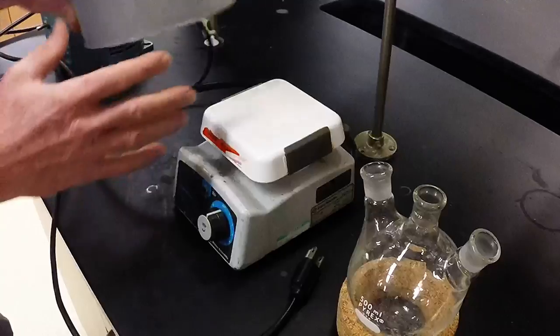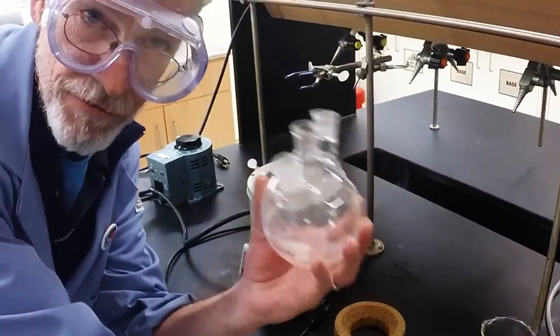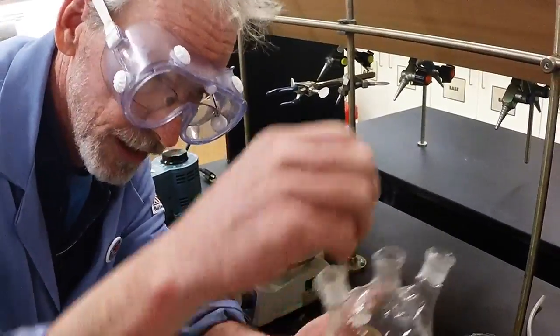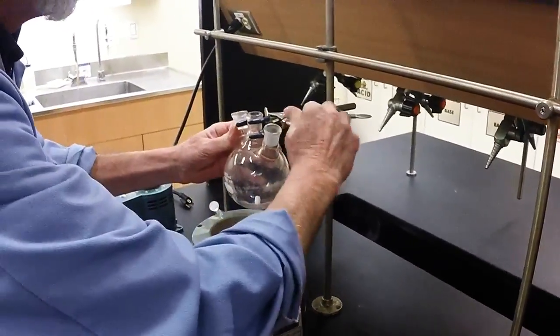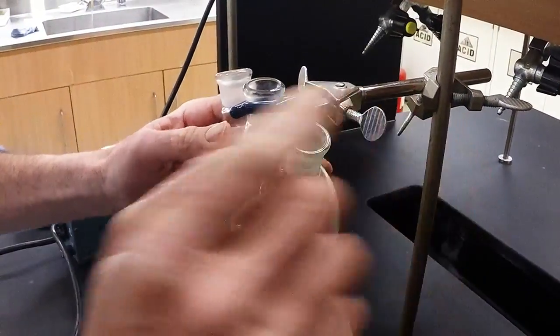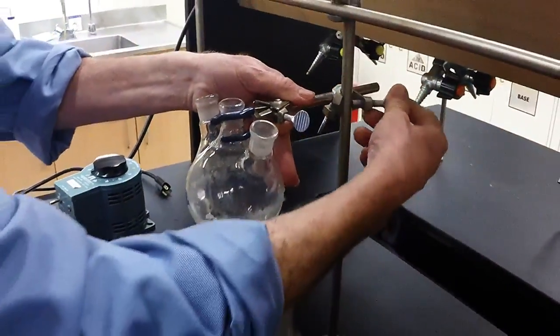Stir plate. Big heating mantle this time, and I have a 500 milliliter three-neck flask. We're going to need a stir bar. Don't drop it — it'll break the bottom. Slide it in the side. Very important: we must clamp nice and square. Make sure the finger is under the lip.